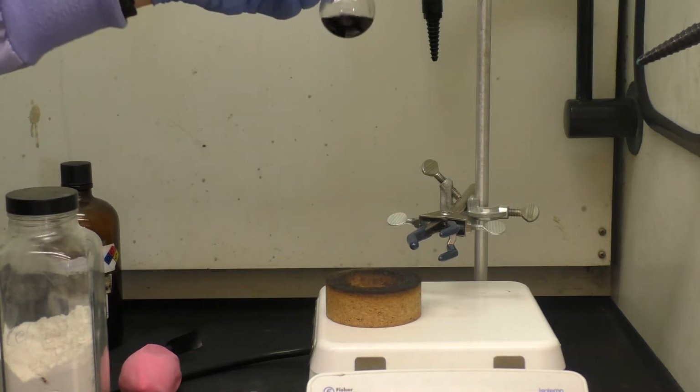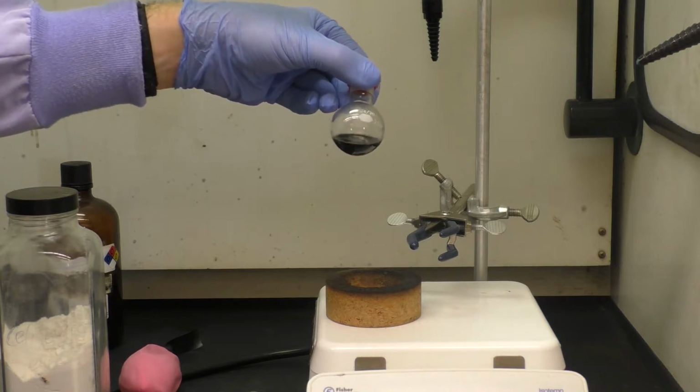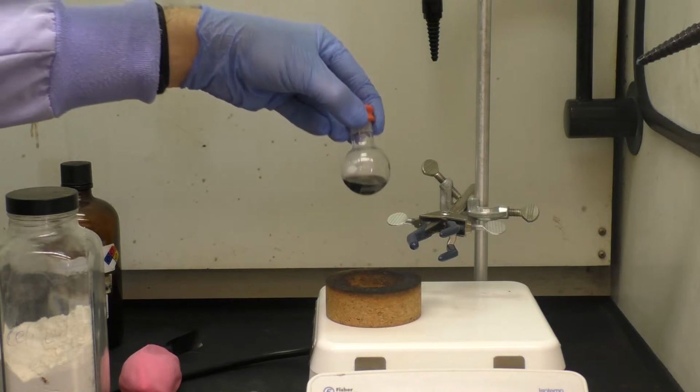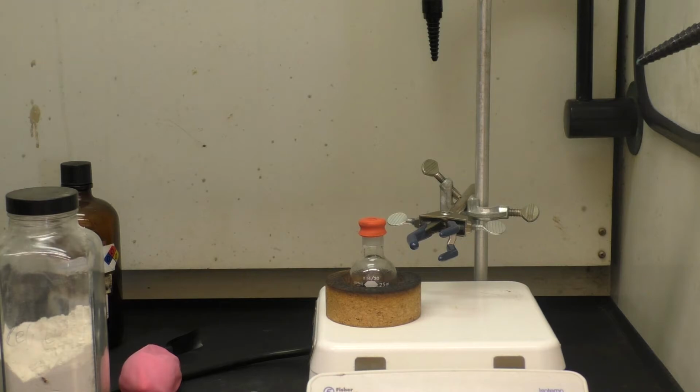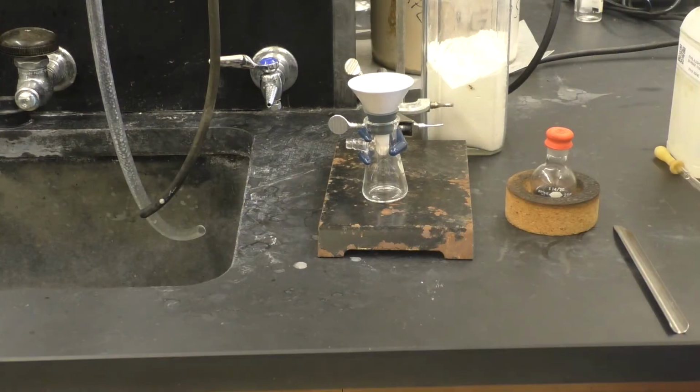It looks pretty much the same as we had at the beginning, simply because of the palladium on carbon making everything look kind of black. We will now remove that palladium on carbon by filtering through a kind of powdery substance known as Celite. So to get rid of the palladium on carbon, we're going to filter through a pad of Celite.